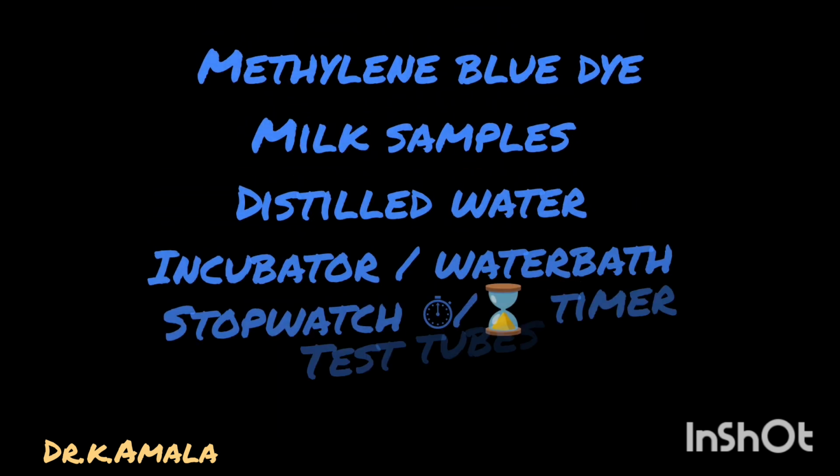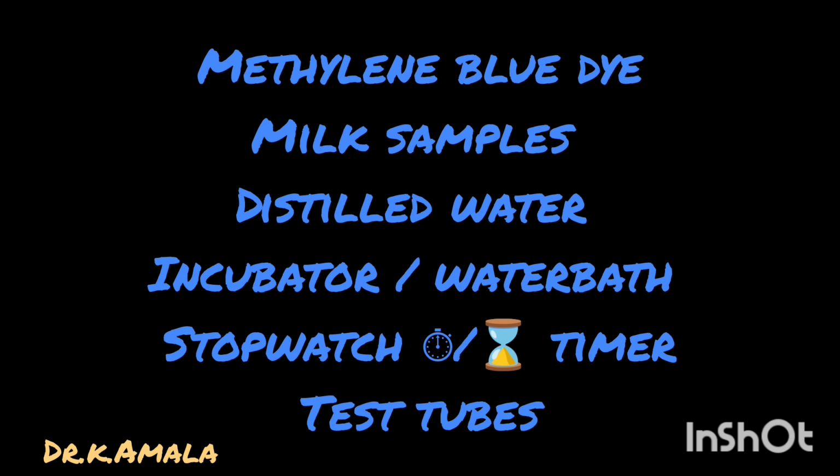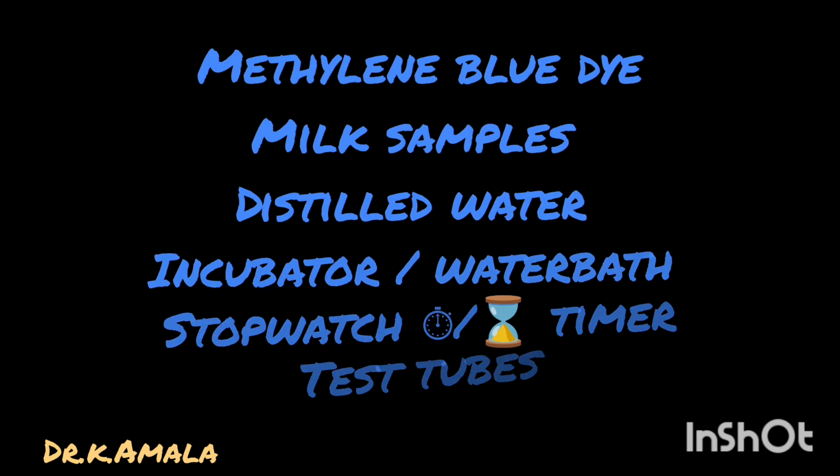The materials needed for MBRT: methylene blue dye, milk samples, distilled water, incubator or water bath, stopwatch or timer, and sterile test tubes.